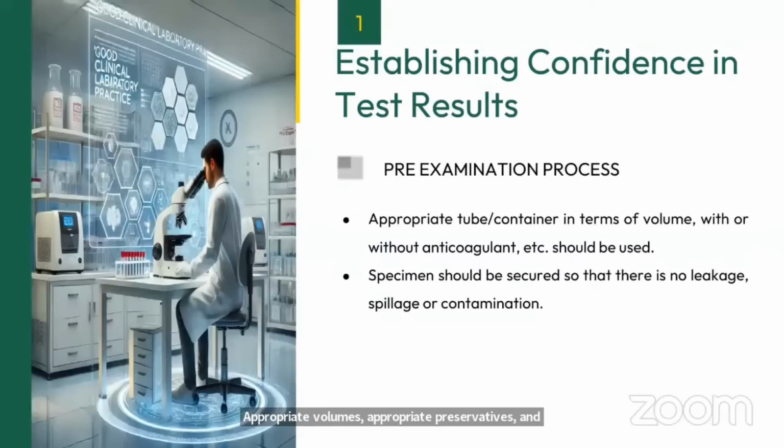Specimen should be secured so that there is no leakage, spillage, or contamination. There are two aspects why we don't want to allow spillage or leakage of the specimen: it can affect the integrity of the specimen, and it can cause a public hazard.